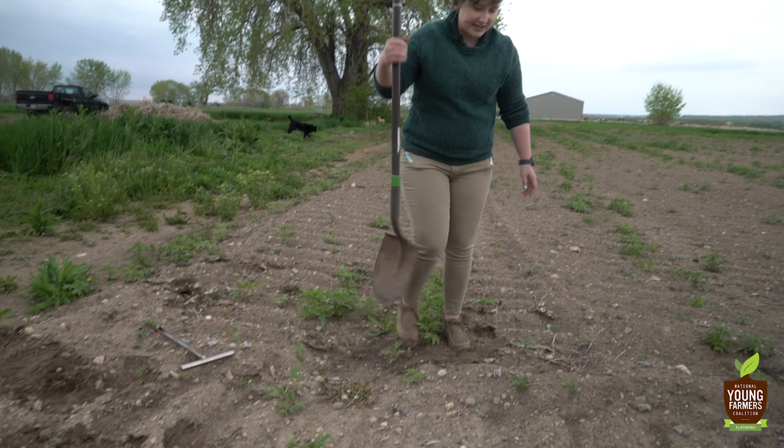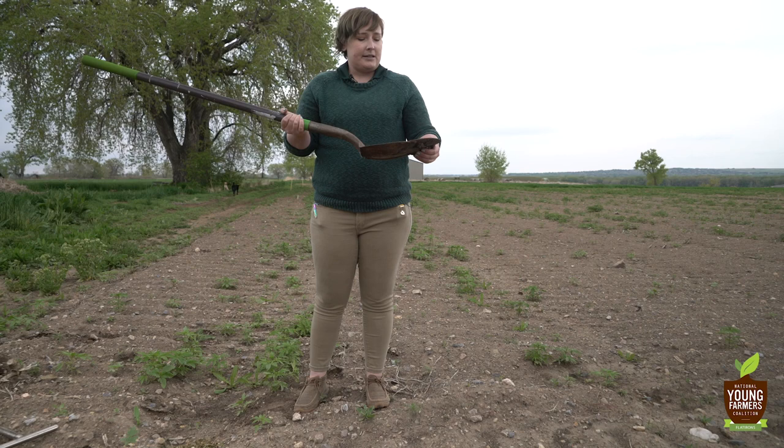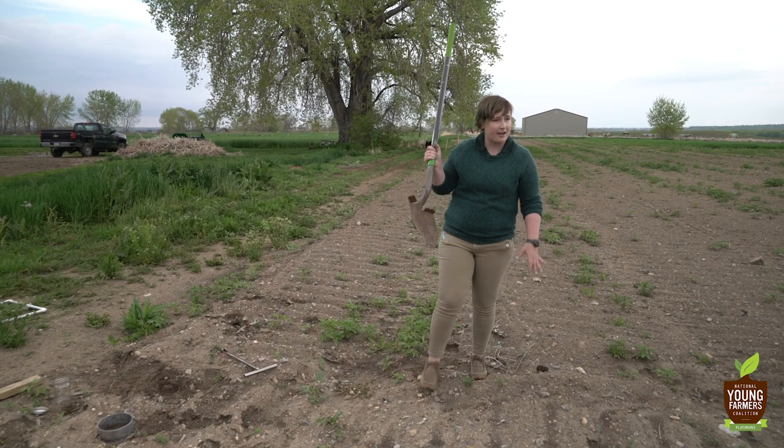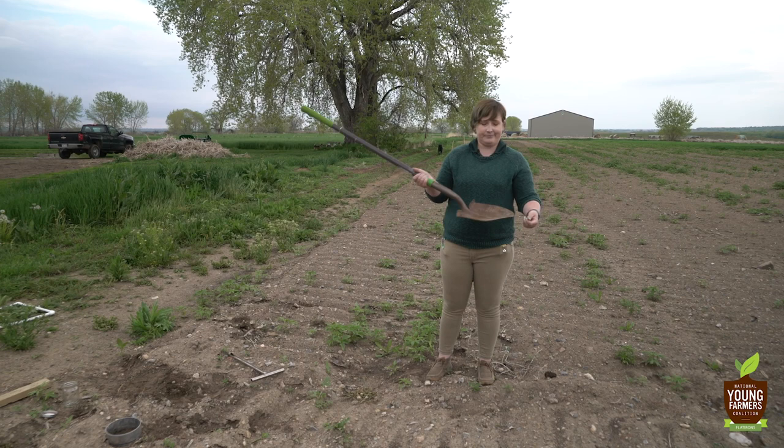If you just have a shovel though, you can still do it, there's no problem. So ideally we wanna take a sample from 0 to 6 inches. And fortunately, this is a good example for taking a sample because we don't have a lot of plant matter on the surface. We don't wanna include our plant matter in our soil sample. We're looking at just the soil.